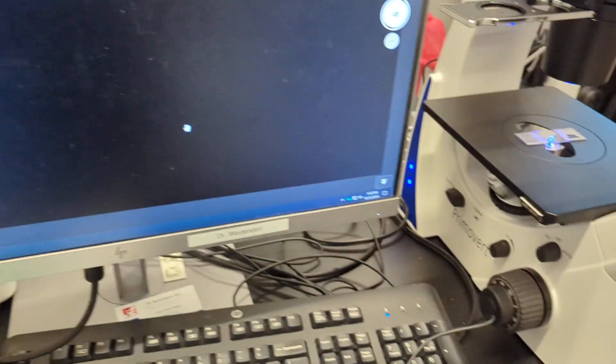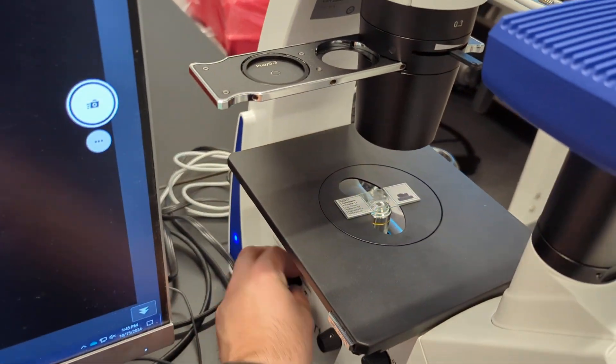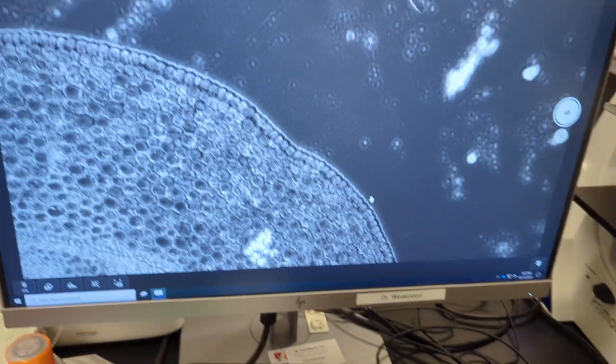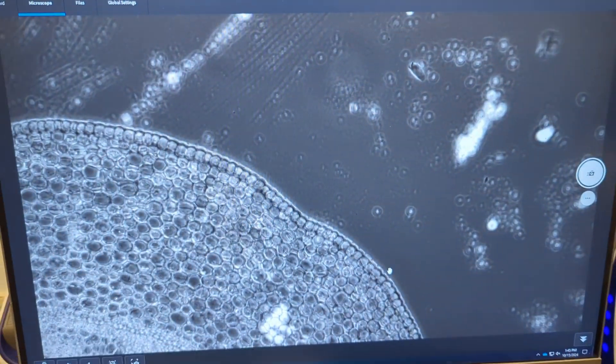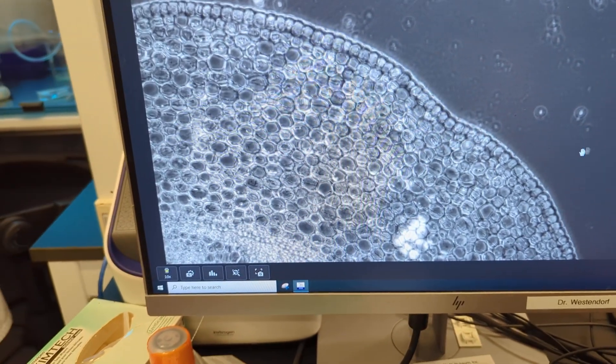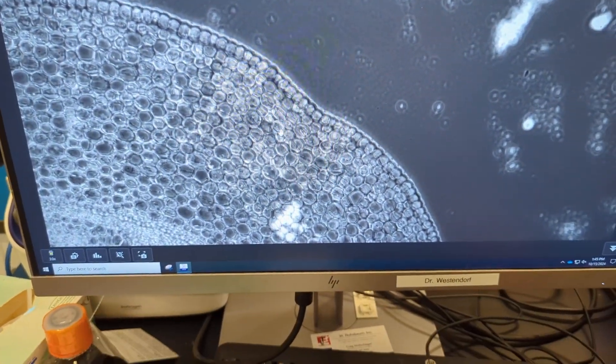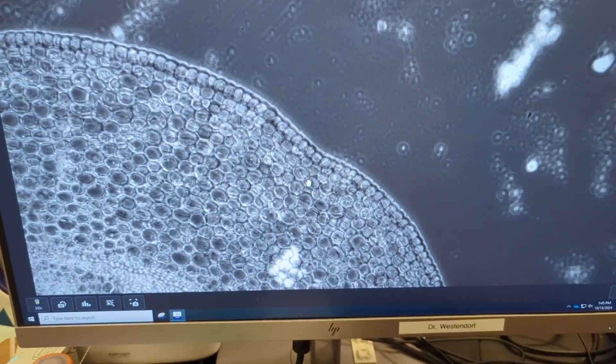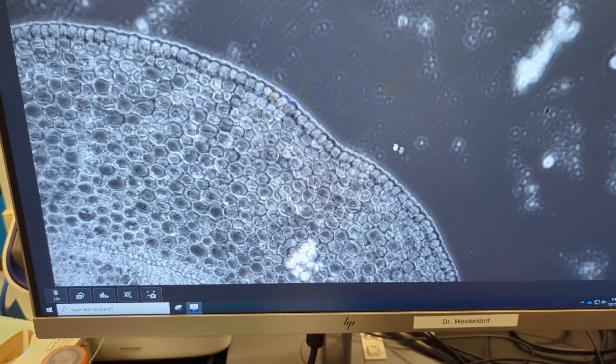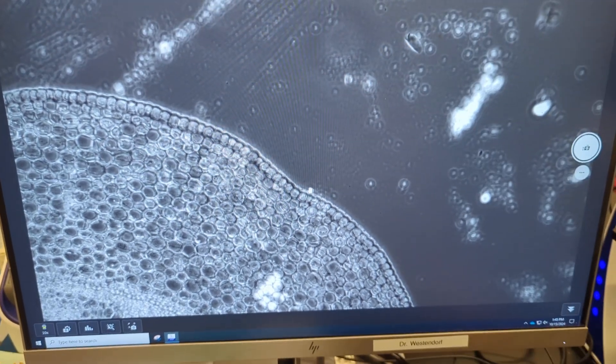So we could do a fluorescence image. It'll still look grayscale on the screen because it's just a grayscale image coming through the camera. So there's no color to overlay, but only your fluorescence cells will show, obviously, on the screen.